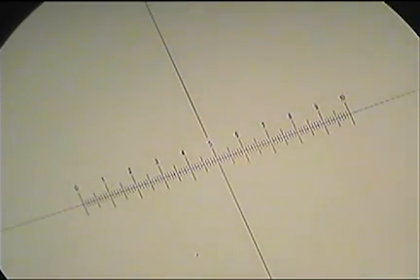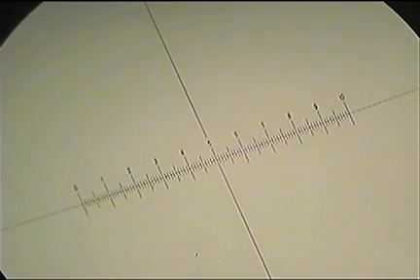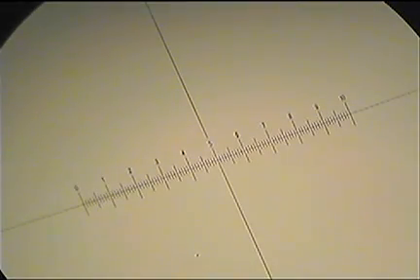Unfortunately, those units don't really mean anything. So we can use that to take measurements, but we first need to calibrate them to find out what each unit on there actually represents. You'll notice that if you flick the microscope onto medium or low power, the scale doesn't actually change, and that's precisely the issue. Because if I'm looking at things at medium, low or high power, we'd be taking a different measurement each time. So we need to use one of these.